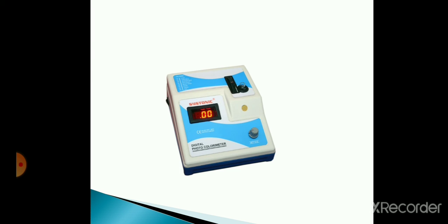Take the absorbance of the standard and test against blank at 505 nm.